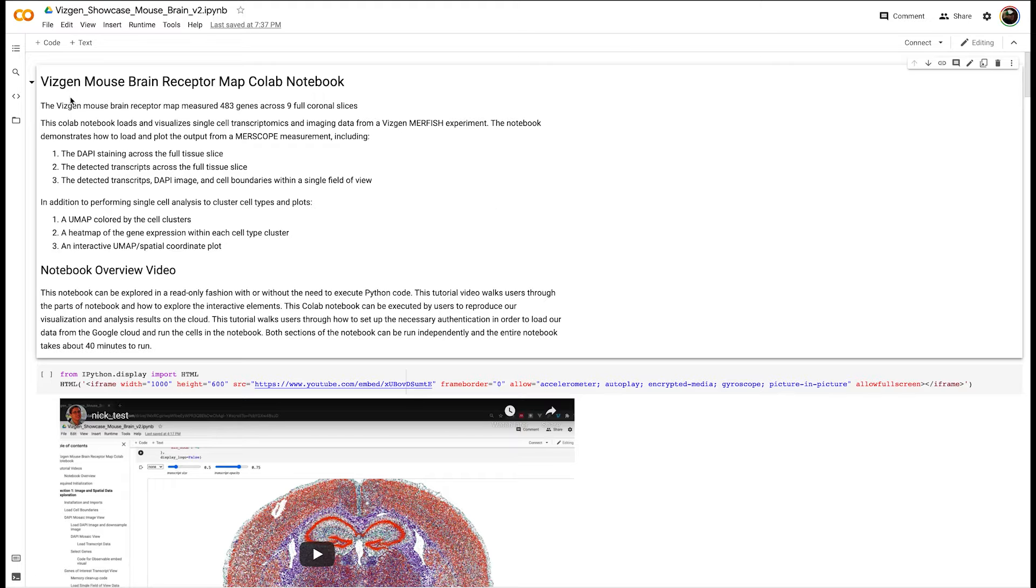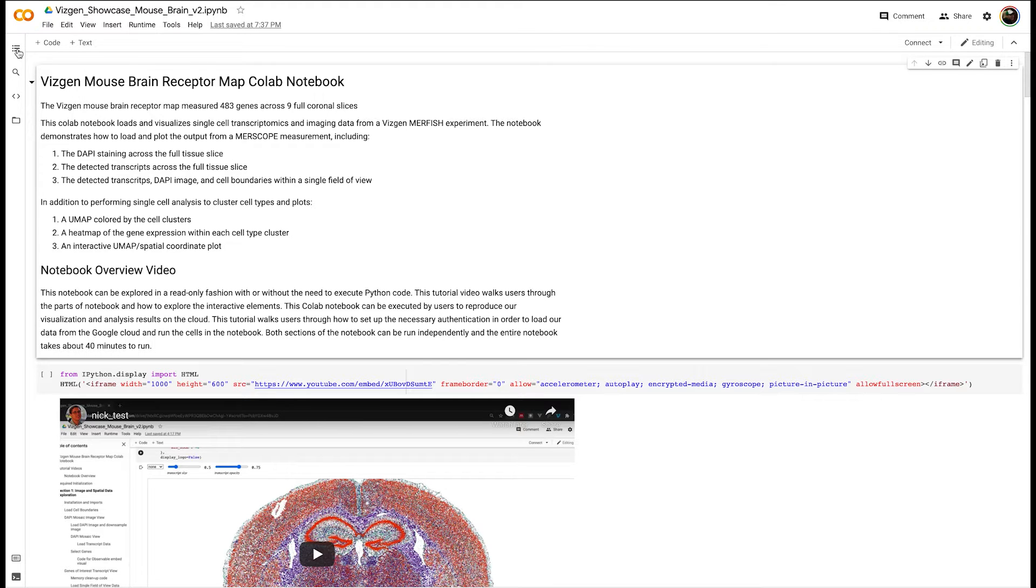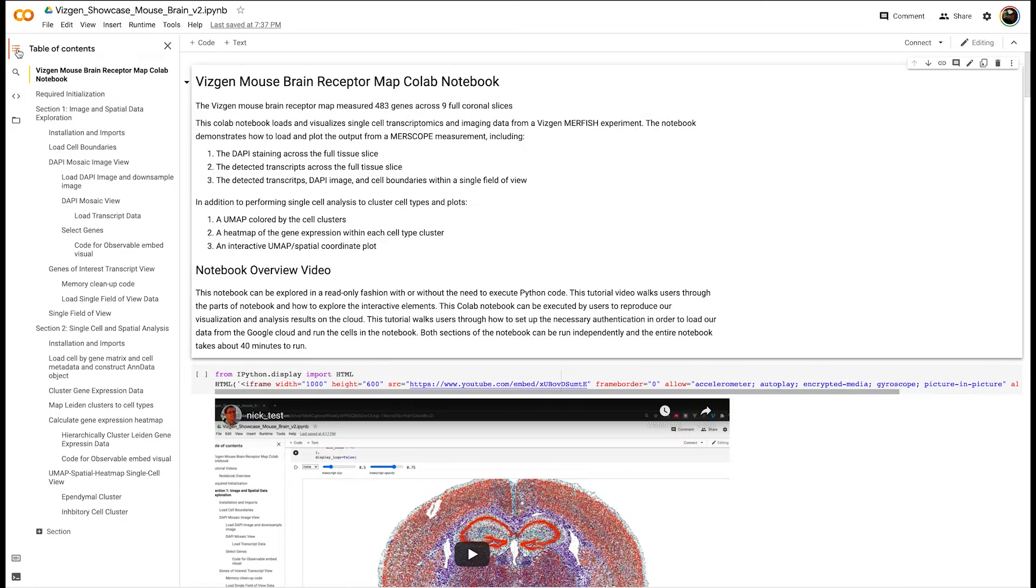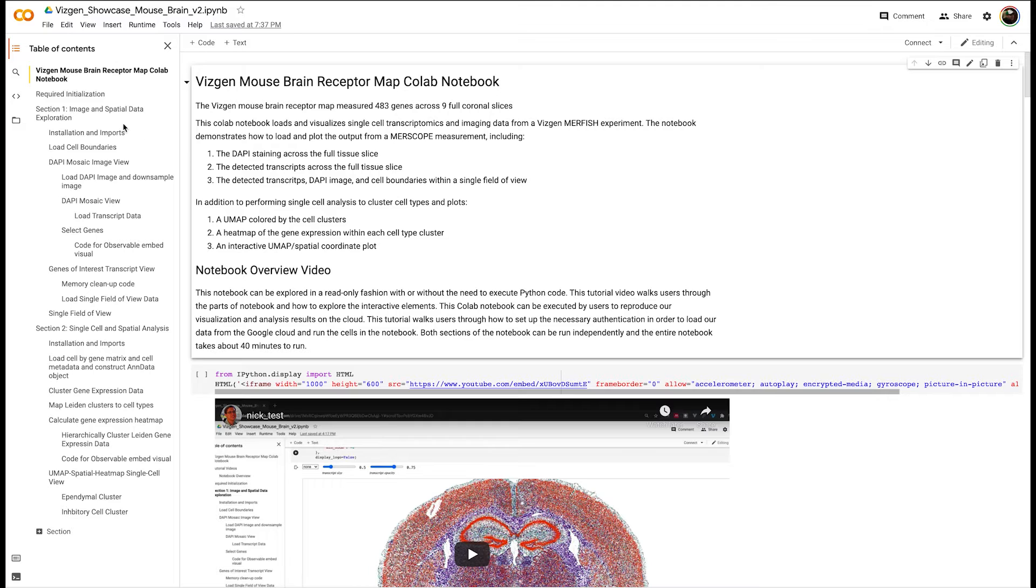This notebook has several sections which can be seen using the table of contents. If you click on the left here you can bring up all the different sections of the notebook. At a very high level we have two sections: the first is image and spatial data exploration and the second is single cell and spatial analysis.